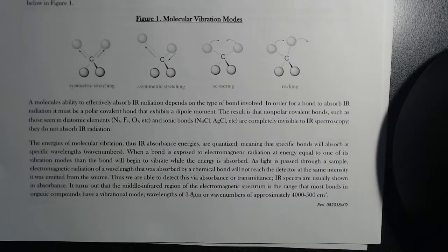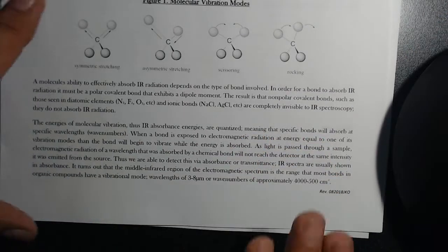If you get pure rock salt, they are transparent. When you start getting them wet, they become opaque, and you can't see through them. So please do not wash the salt plates with water. We use things like organic solvents. That's the whole polarity thing, right? So the organic solvents are used for cleaning these, not water. All right.